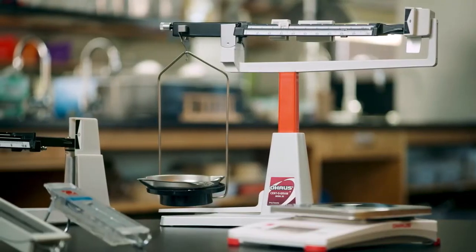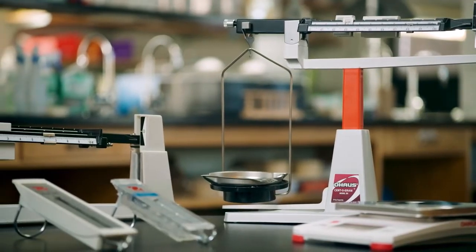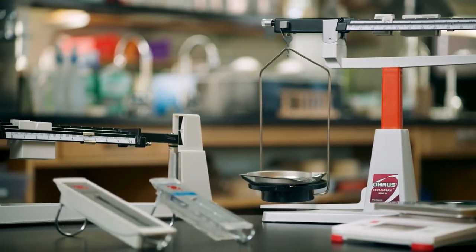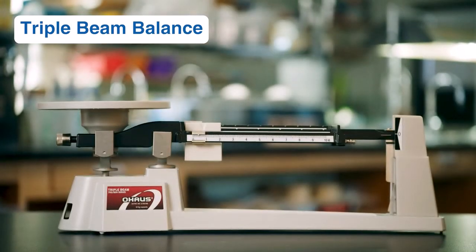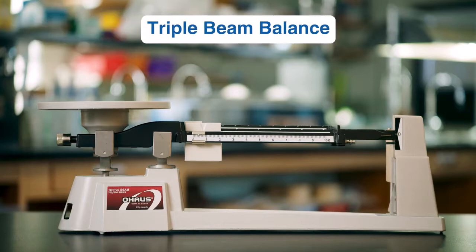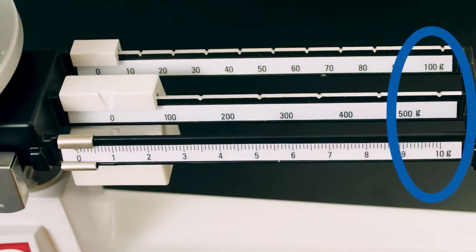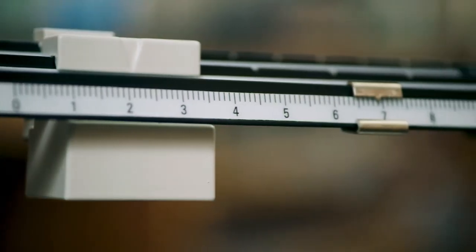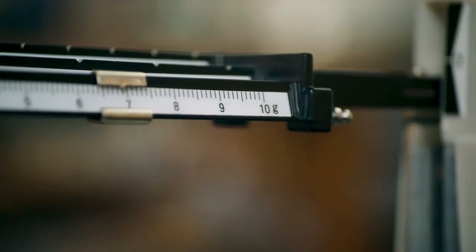To measure mass, you need a balance. There are several types of balances that can be used to measure mass. One type of balance that is used to measure mass is a triple beam balance. To use a triple beam balance, select a balance that has a maximum mass that is greater than the item to be measured. For example, in this video, the maximum massing capacity is 610 grams. Examine the increments of measurement. A triple beam balance can measure in the smallest increments on its bar that measures the lowest mass. In this case, the 10-gram bar measures in tenths of a gram.